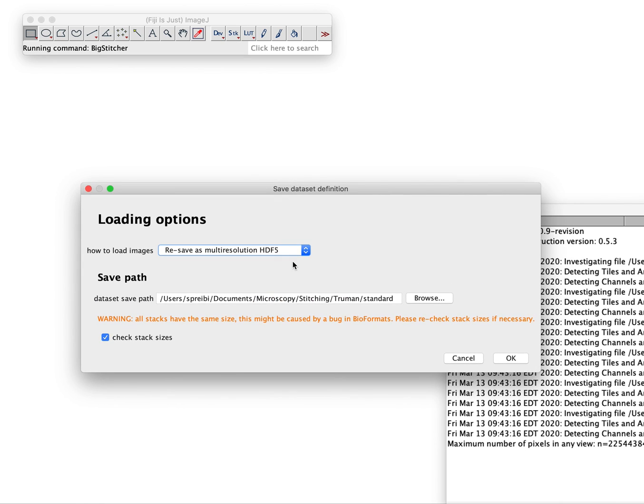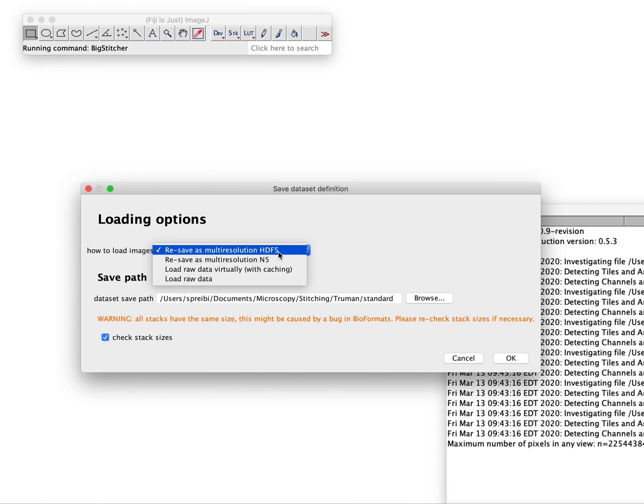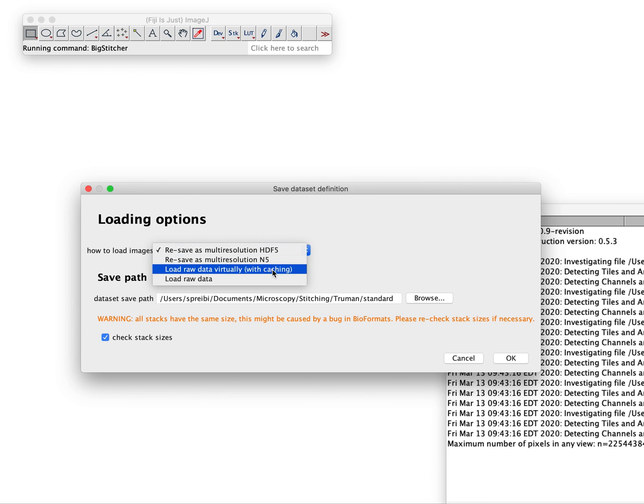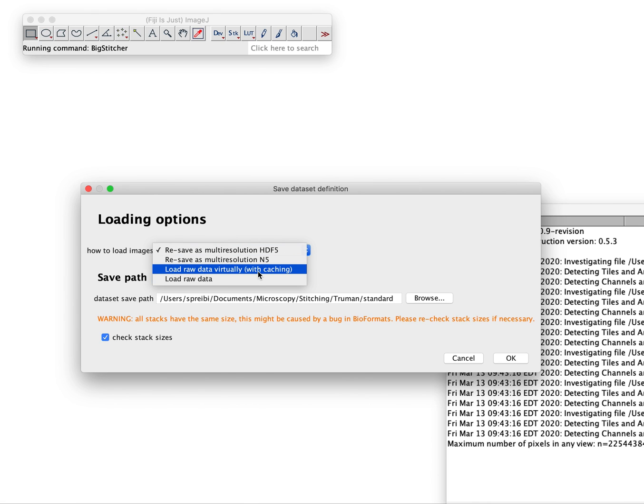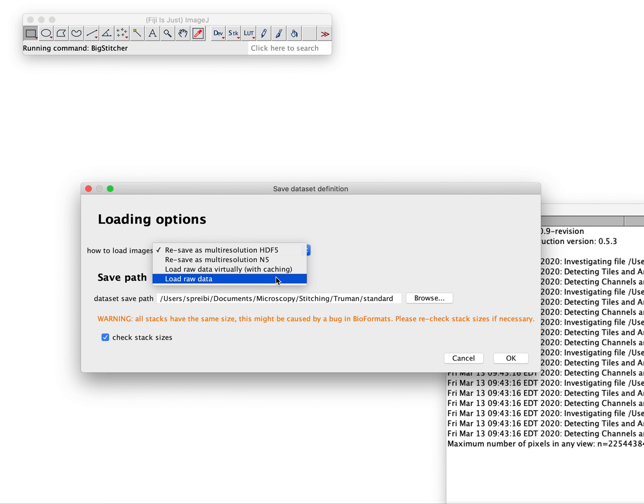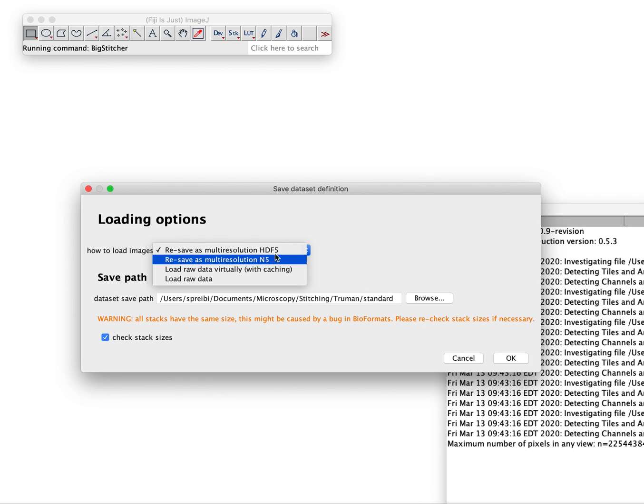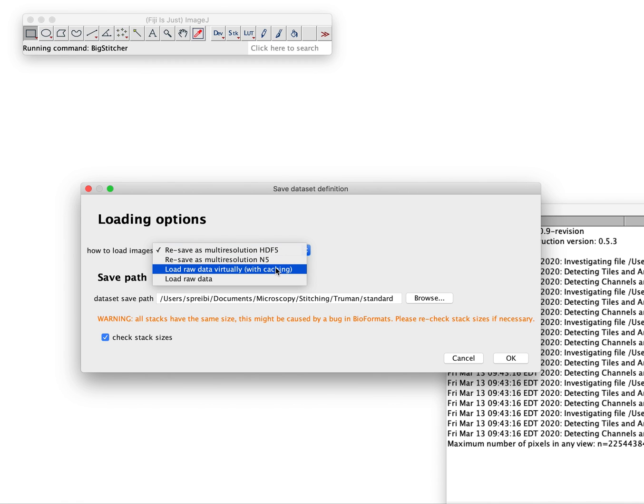Now comes the important question: How do we hold the data when we work with it? We could resave it as HDF5, that's the option that was always there. We can resave it N5. We can not resave and load it virtually and on top of it use the image lib to cache the whole thing, or just load the raw data as always.